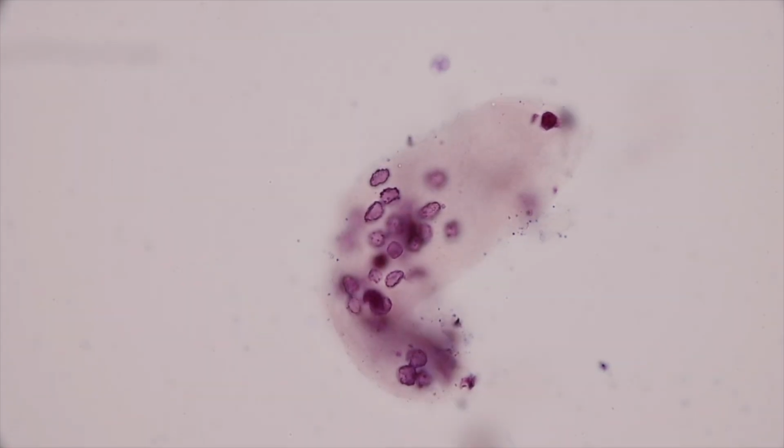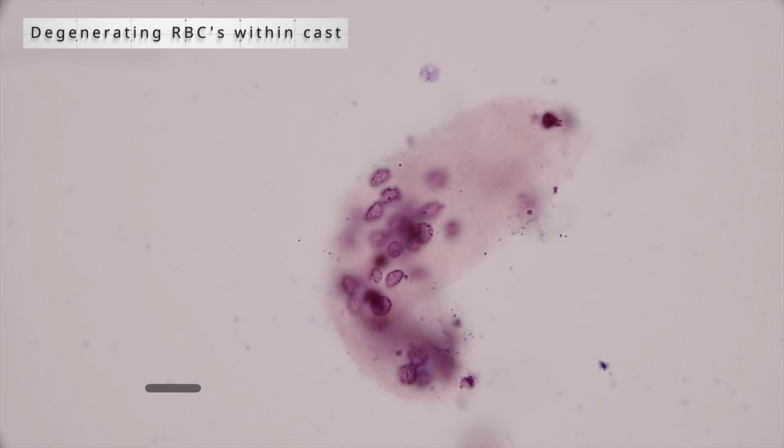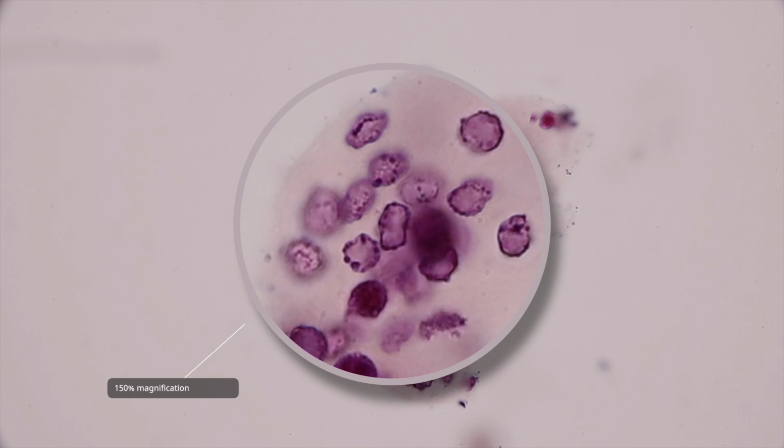This next slide is a good example of degenerating red blood cells. Here under 100x oil objective, you can see the presence of Heinz bodies, which are clumps of denatured hemoglobin along the red blood cell membranes. Here magnified an additional 150%.